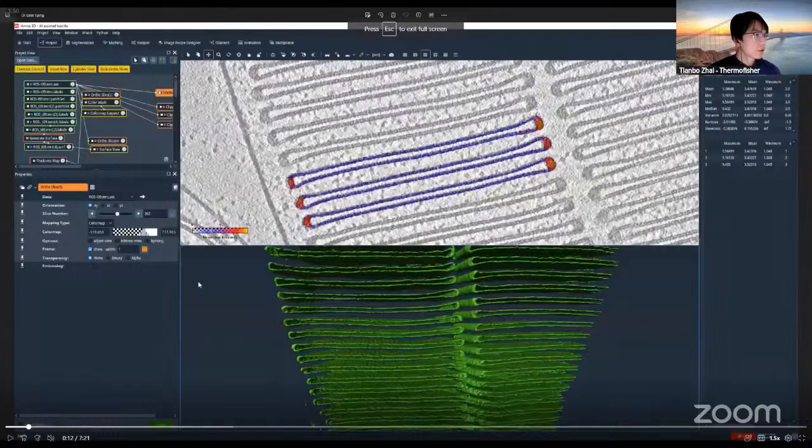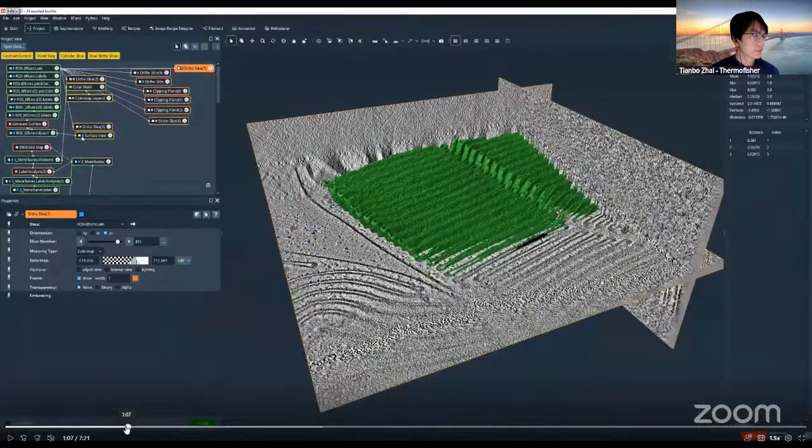So this is the overview that I just explained inside of the software. And this is after the segmentation has been done. As you see, one way to validate and understand the quality of your segmentation visually is that you can overlay the 3D structure on top of what you already have, the raw image.